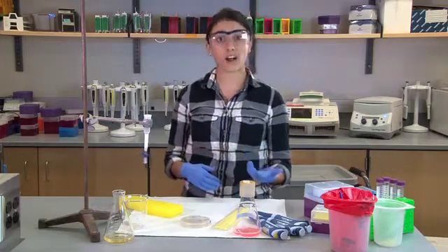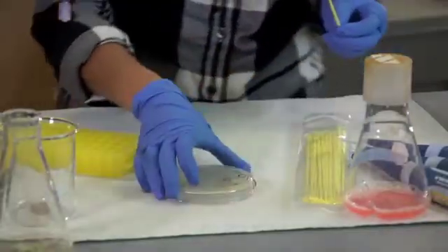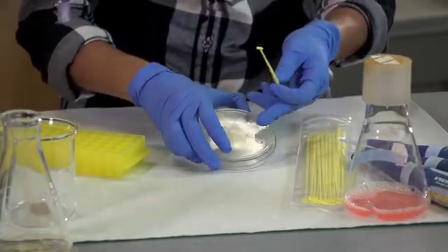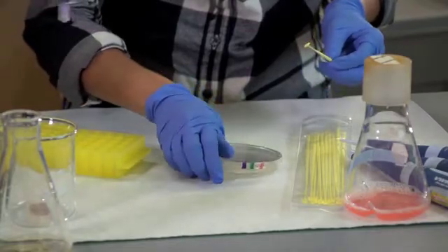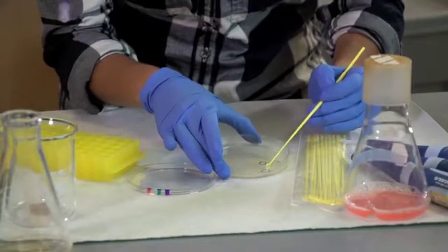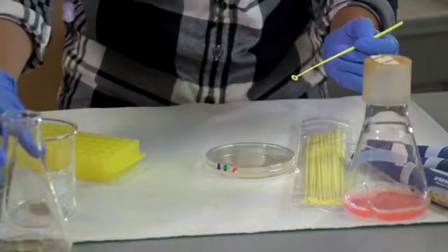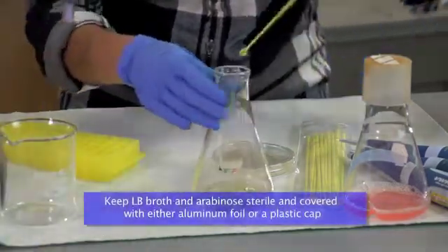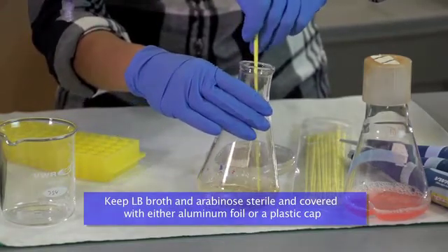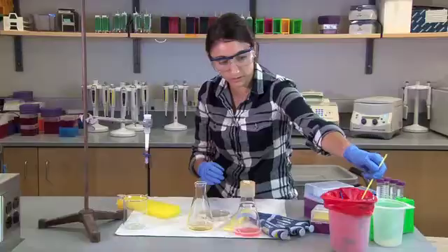So in order to start that bacterial culture, teachers can take a sterile inoculation loop, get their arabinose plate, find a lovely pink colony, so these E. coli are expressing RFP, pluck that E. coli fly up, and inoculate a flask of LB plus the antibiotic. Dispose of the loop properly.